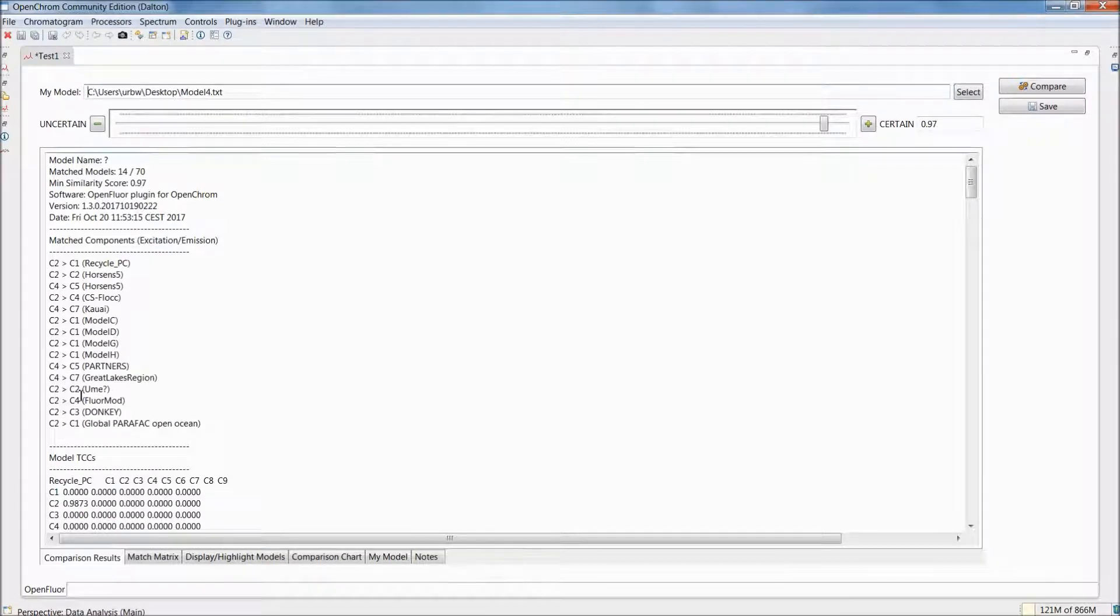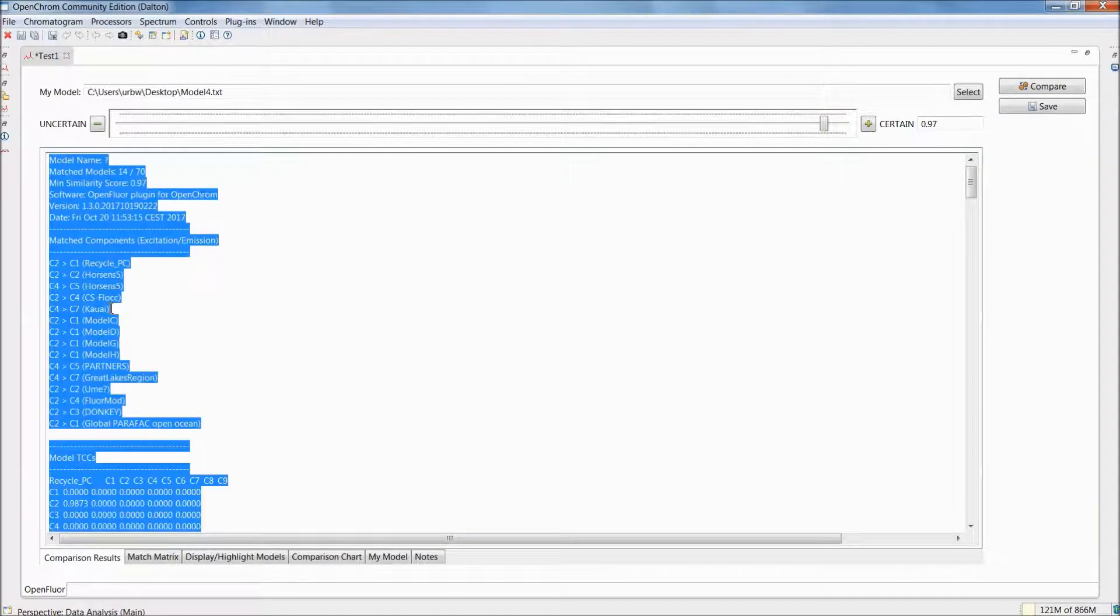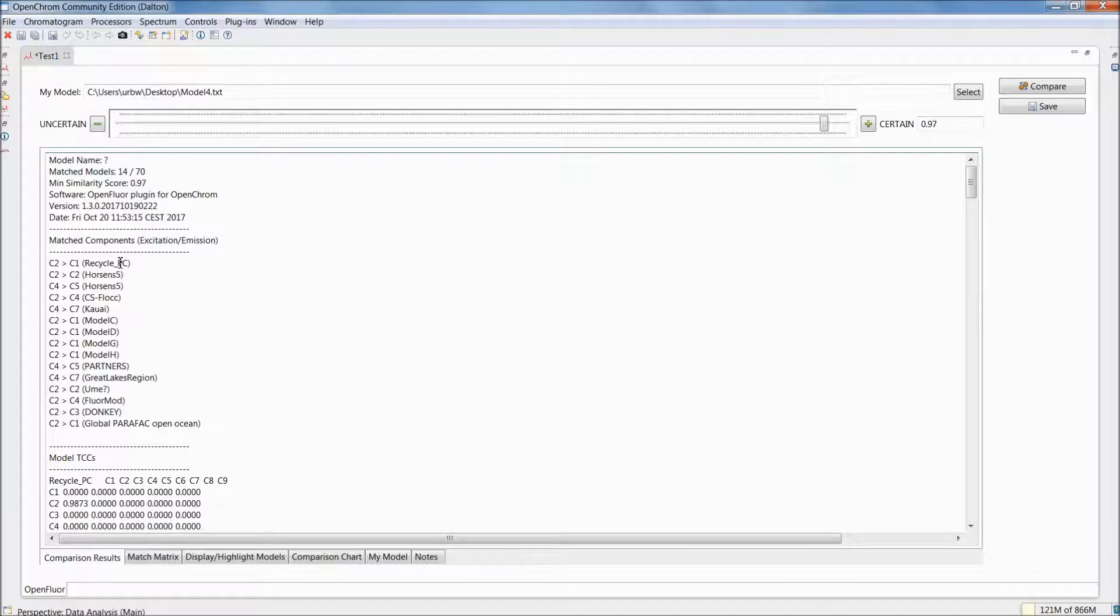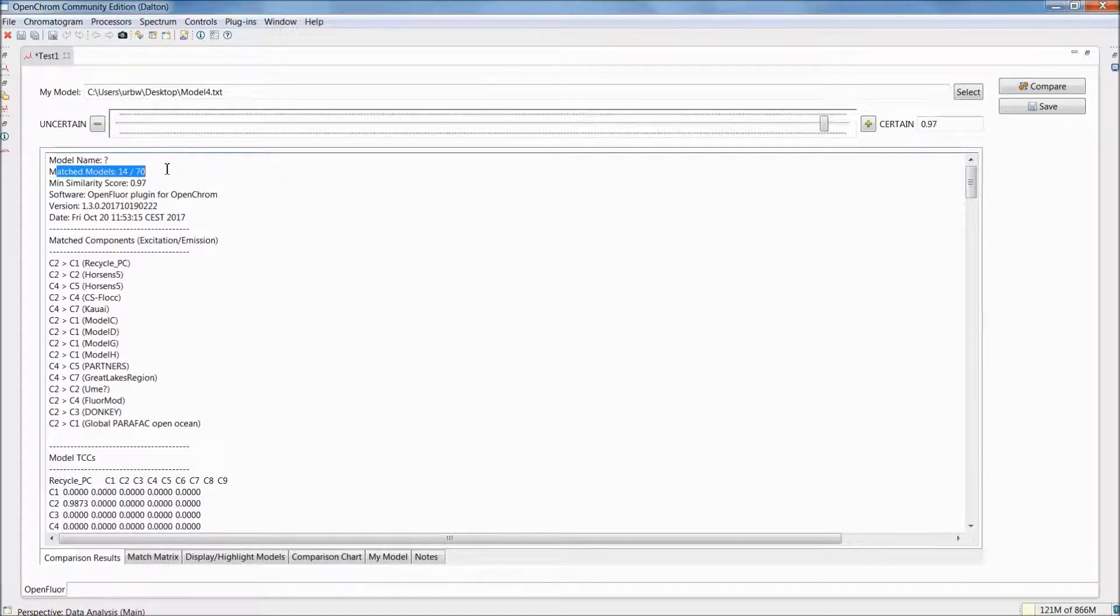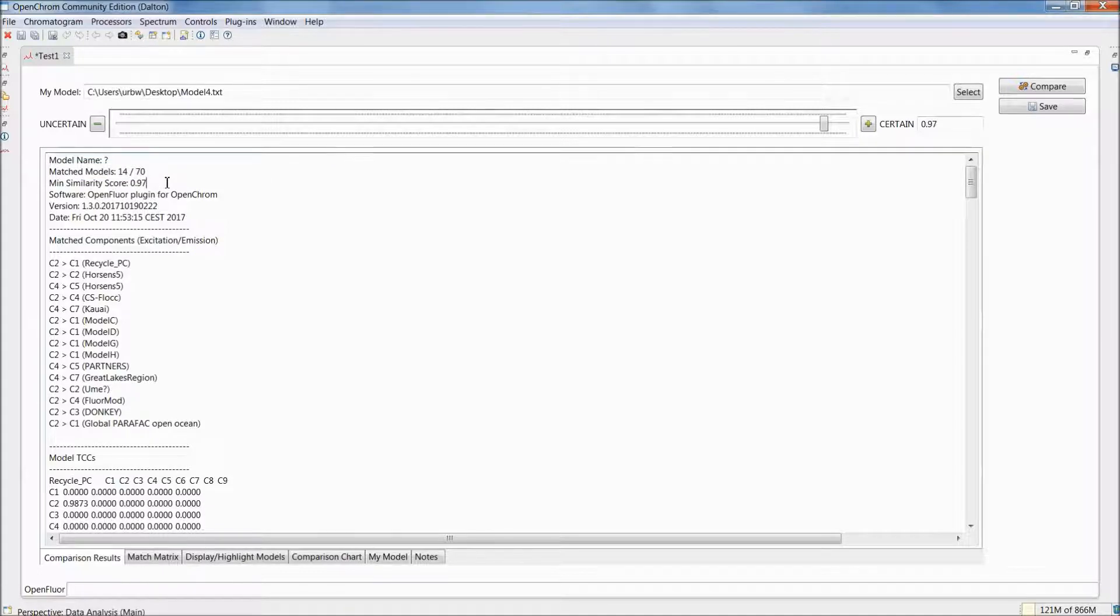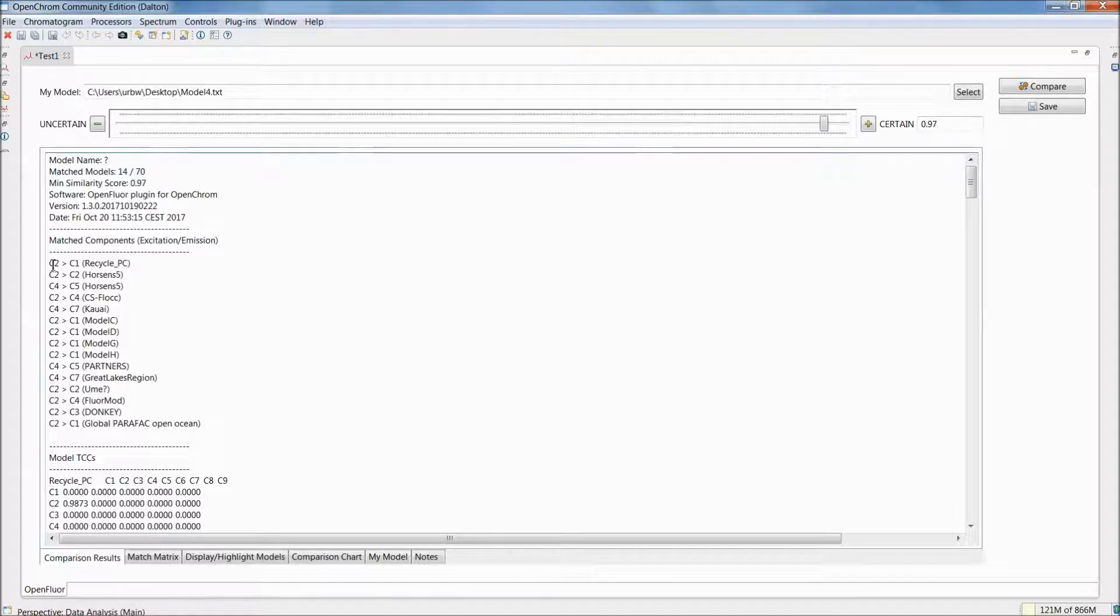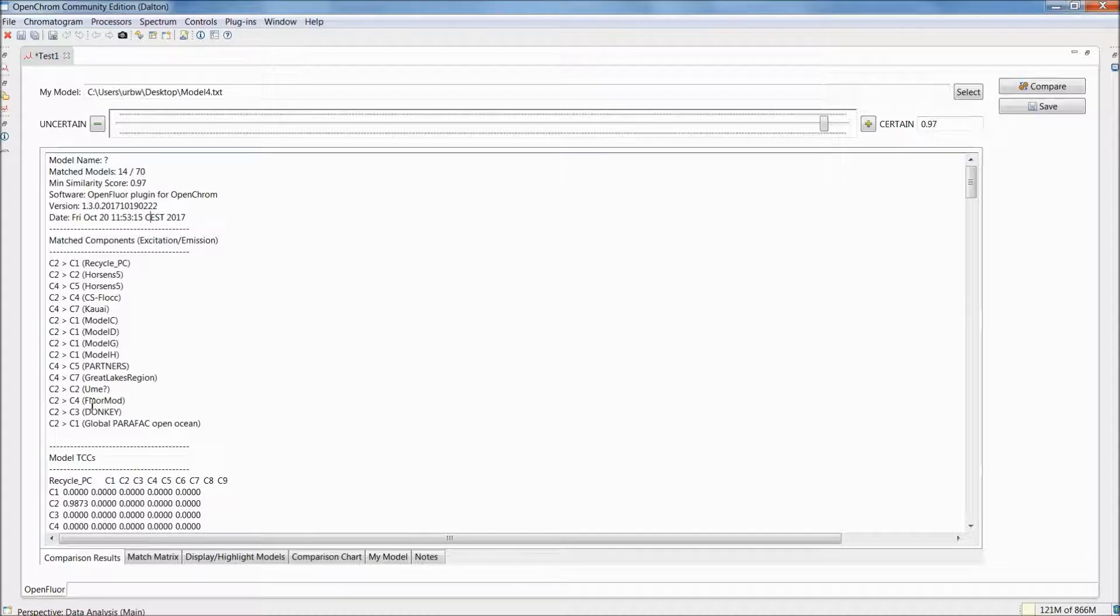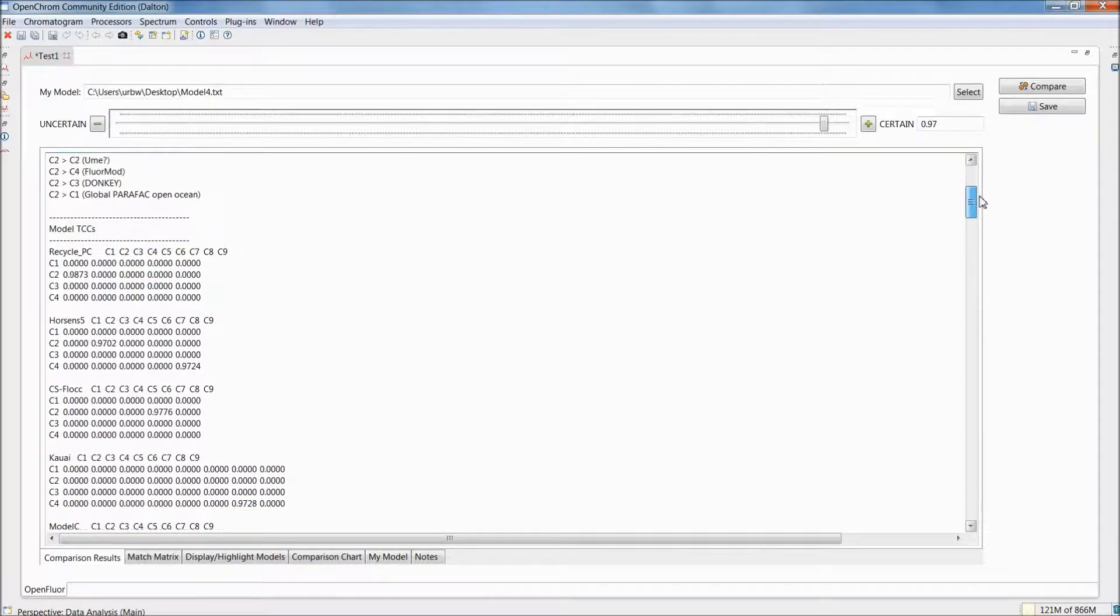The first thing that you'll notice is the comparison results tab. This tab is a quick overview that's actually copy and paste friendly, so you can select everything that's in here and copy and paste it into either Excel or Word or whatever you want. This overview starts with your own model information, the number of matched models, which is 14 out of 70 models in the database, a reminder of your minimum similarity score, and the software and its version, as well as the time of the matching. This is followed by a quick overview of the spectral matches. You can see that in our case we only got matches with component 2 and 4, and various components in various models of the database. This is the quick overview, but now it's also interesting to see how well the components matched, and this is what follows here.